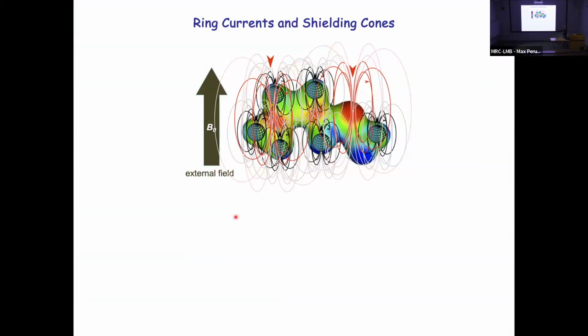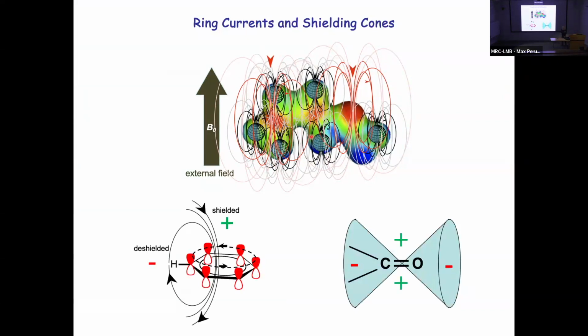So there we are. We have this landscape of local magnetic fields. Each nucleus in the molecule generates its own little profile that adds to the landscape. So everything in there has a unique chemical shift that is dependent upon the chemical composition and the three-dimensional structure of the molecule at the same time. We also get the circulation of electrons not just immediately around the nucleus, but delocalized electron clouds in aromatic systems and in pi-bonded systems, for example. And they make a big difference to the local magnetic landscape as well. It's not just the immediately local fields.